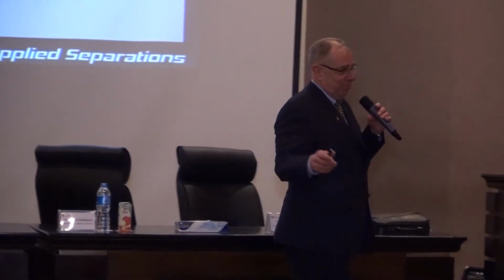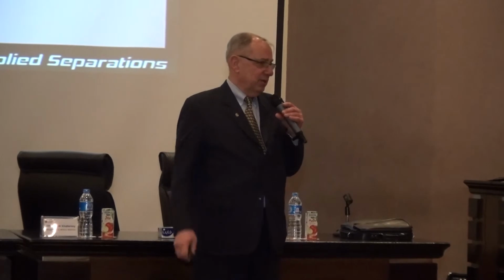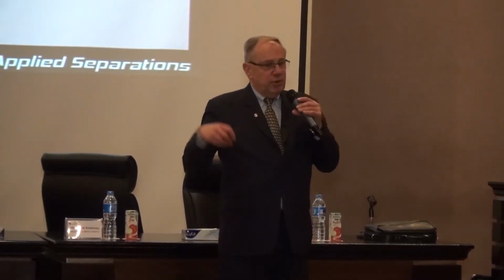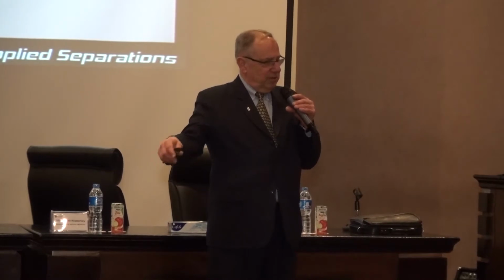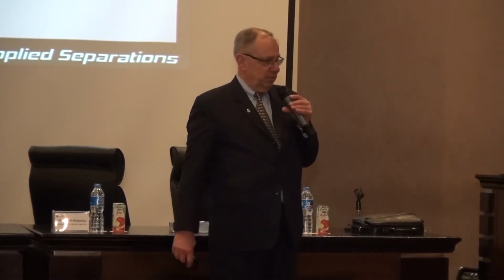Obviously, there are problems with supercritical carbon dioxide as well. I mean, nothing comes without some disadvantages. Of course, there are some disadvantages. The major disadvantage is the fact that you have a pressure vessel. You have to deal with higher pressure. You can't do this work under ambient state. That is the major drawback. And when you're dealing with a pressure vessel, this initial technique usually tends to be more expensive.